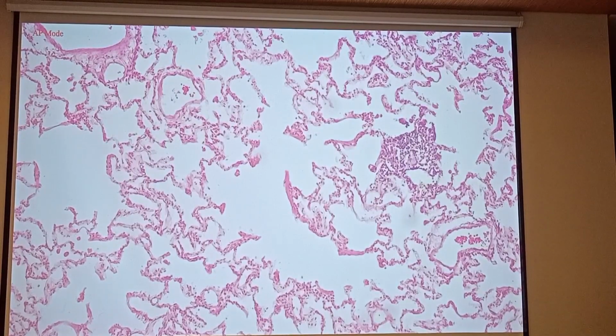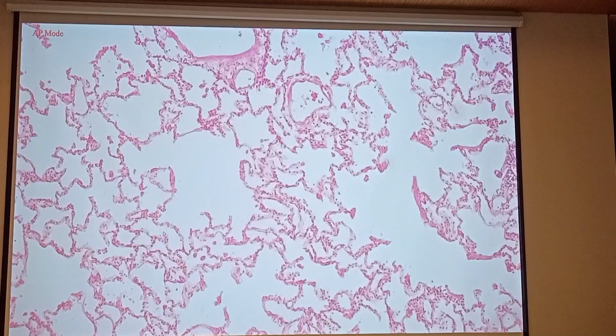Can you see how thin a normal lung is? A normal alveolus is? Yes? And you see the thickness of the other alveoli in pneumoconiosis, for example. Yeah? So as you can see here, there's a giant cell right here. There's a lymphoid infiltrate right there. And some of the macrophages, like so. Others are not involved, but eventually, if it becomes more extensive, it's going to involve everything, including the entire lobule of the pulmonary tissue.